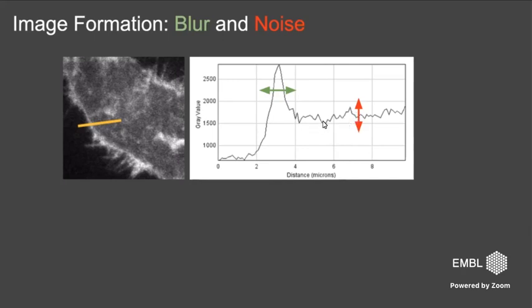The other thing is all these little fluctuations here inside of the cell. Another question: are they real or not? Could be just noise, photon noise for example, or it could be really the distribution of the receptor. Again, something you have to consider when interpreting such data.